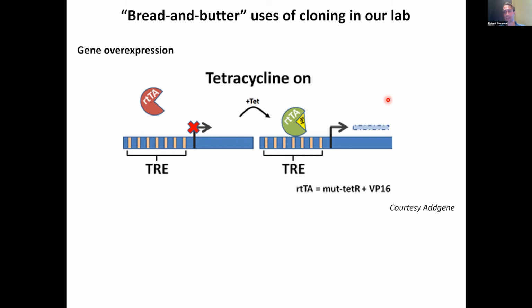Sometimes if we don't need that gene to be inducible, we'll replace this TET responsive element promoter with a constitutive promoter like CAG, CBA, EF1 alpha, or PGK. Those are common mammalian expression promoters, where when we introduce a plasmid in the cell that has a promoter and gene of interest, the cell will constitutively pump out copies of that gene. Often we try to insert these into the genome of our cells, which would not be depicted here.